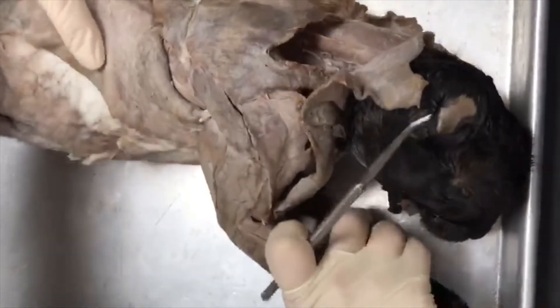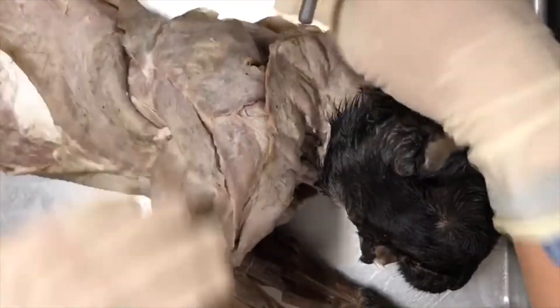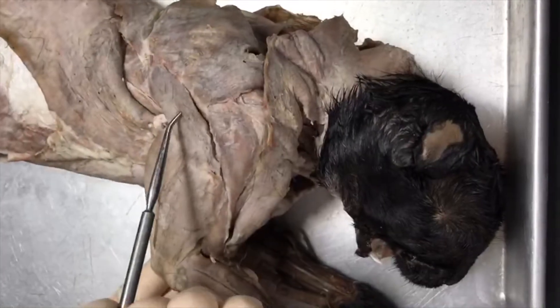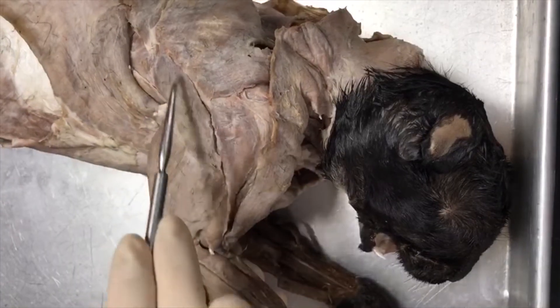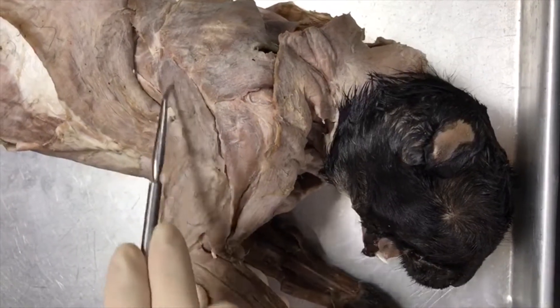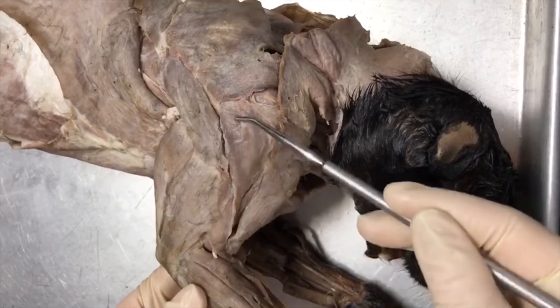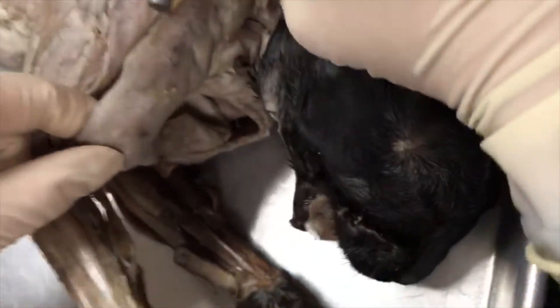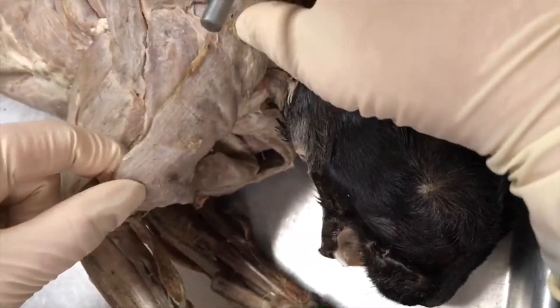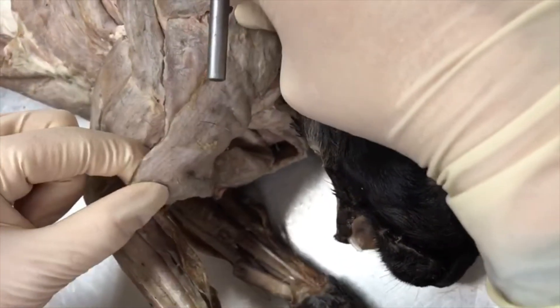If we flip the cat onto its side, we can look at the deltoids. There are three parts of the deltoids: one, two, and three. This one here is going to be your spinal deltoid. The middle one is going to be your acromiodeltoid. And this large upper one here is going to be your clavodeltoid, also known as your clavobrachialis.